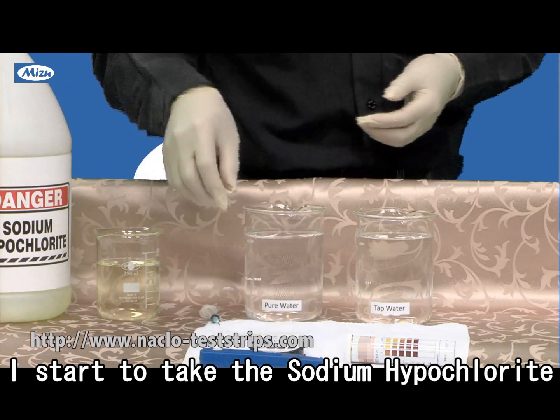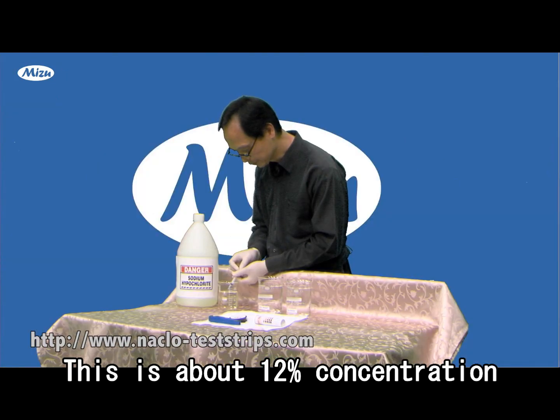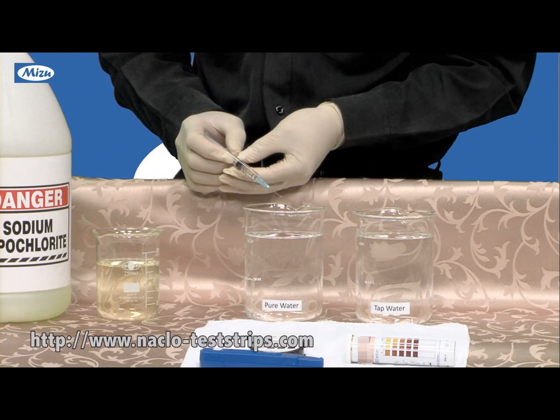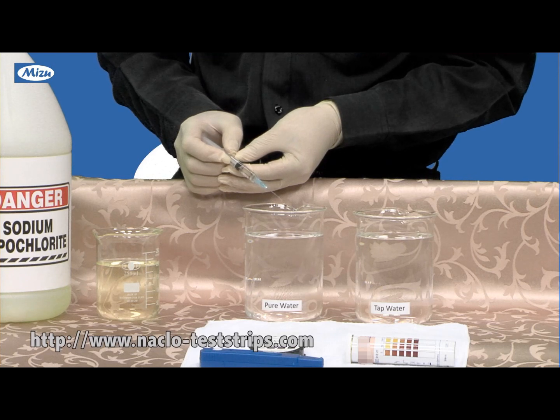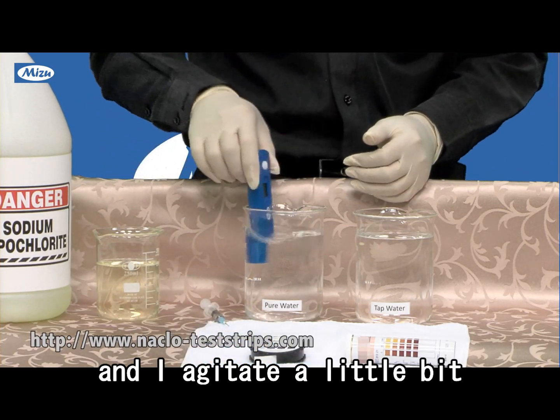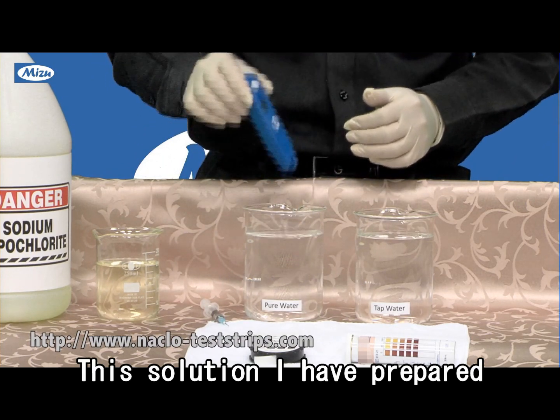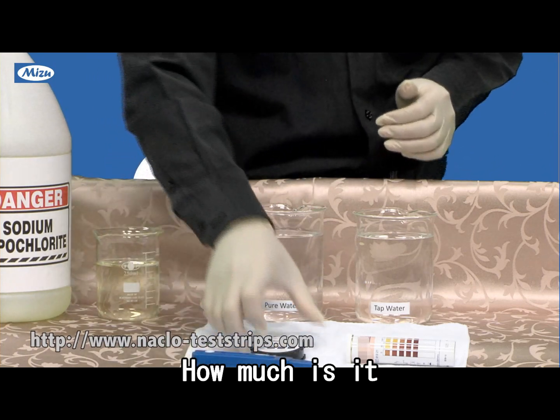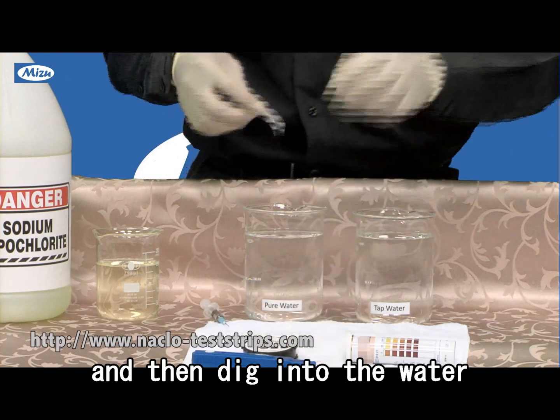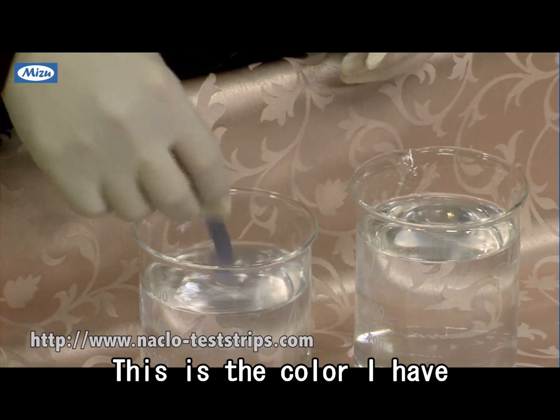So I started to take the sodium hypochlorite — this is about 12% concentration. I add it in this pure water and agitate it a little bit. So this solution I prepared — how much is it? I take this test strip and dip it in the water. This is the color I have.